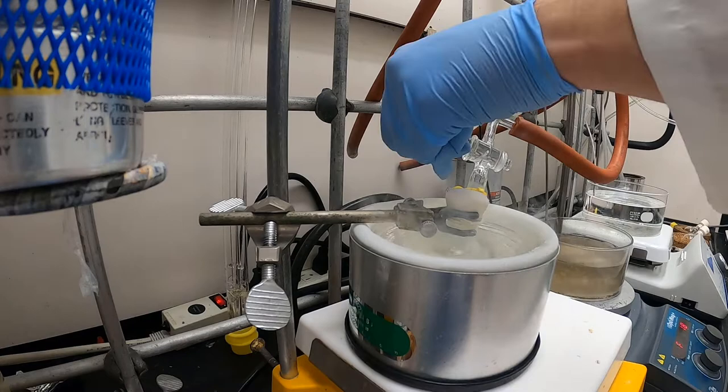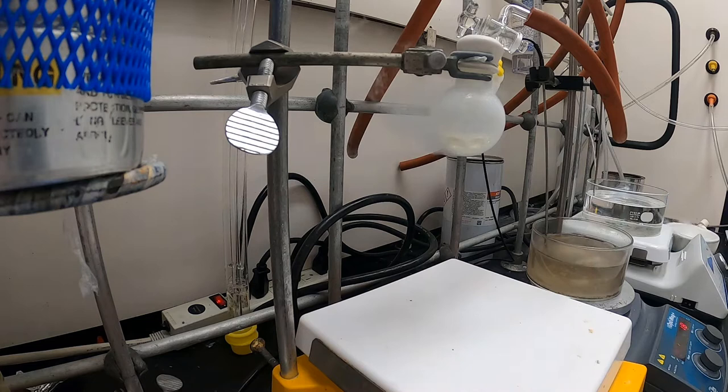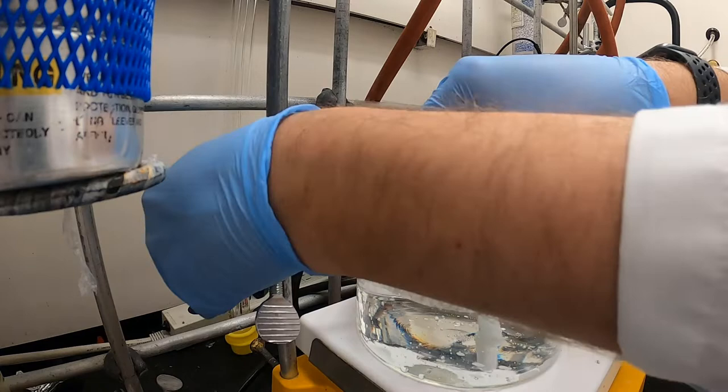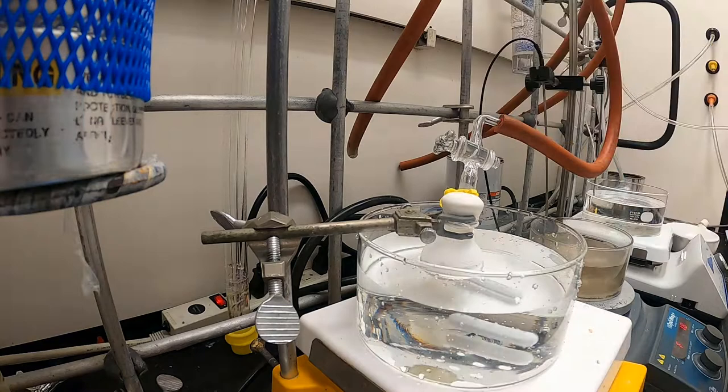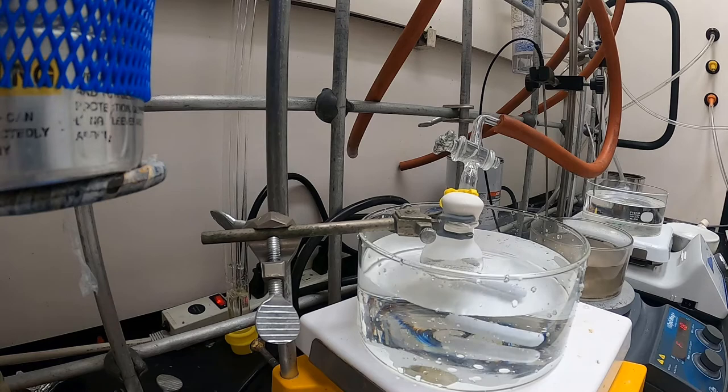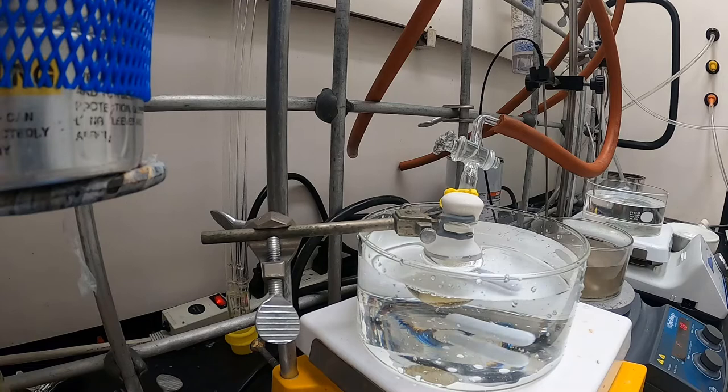After applying vacuum for a few minutes, I close the stopcock and remove the flask from the liquid nitrogen. I will then thaw the reaction mixture using a water bath. After the reaction mixture thawed, the dissolved air formed bubbles in the solution, which then occupy the headspace within the flask. You can also notice the reaction mixture has changed to a more brownish color.